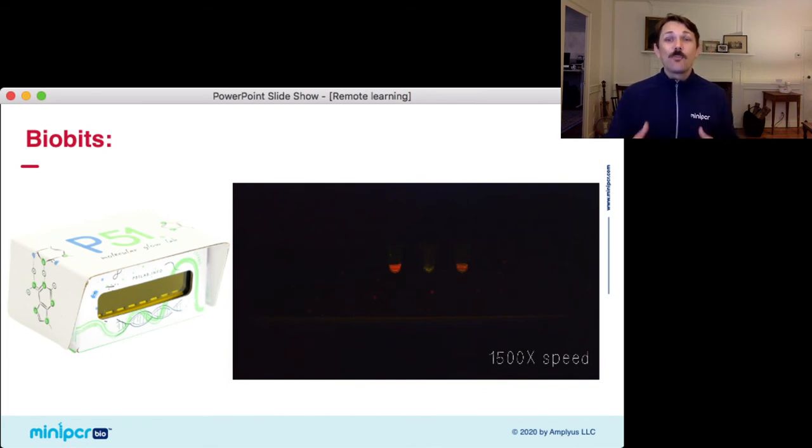For the actual lab, we have manipulations to this. So if you change the system in different ways, students can predict how changes to the system will affect the production of mRNA and protein.